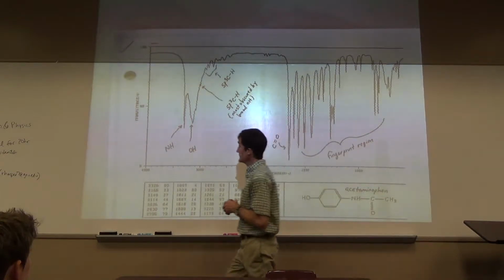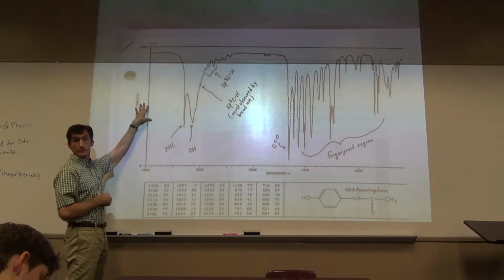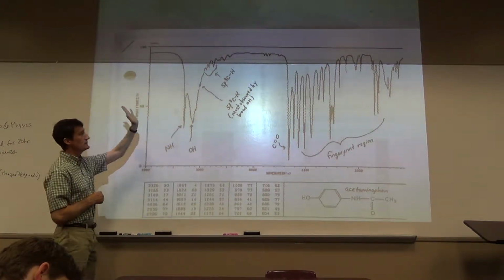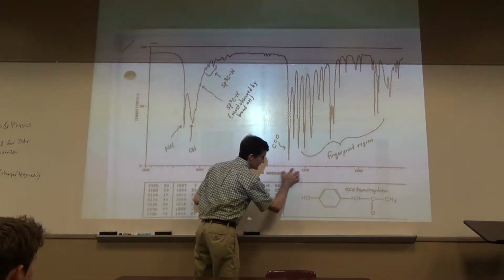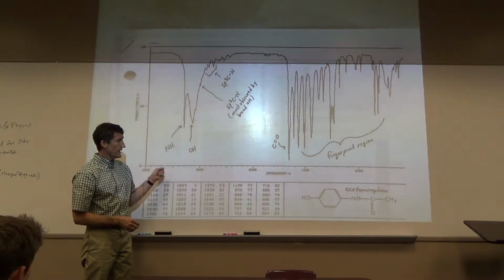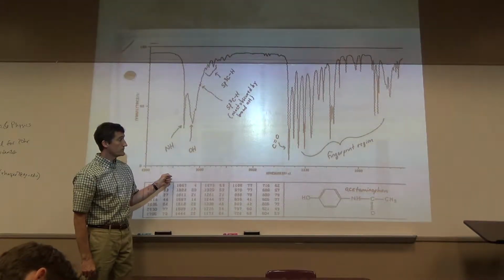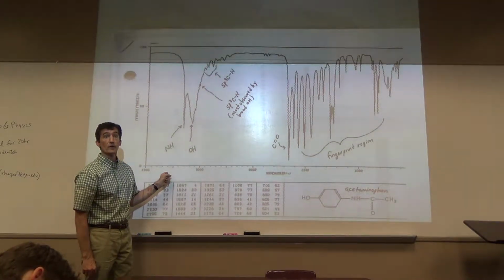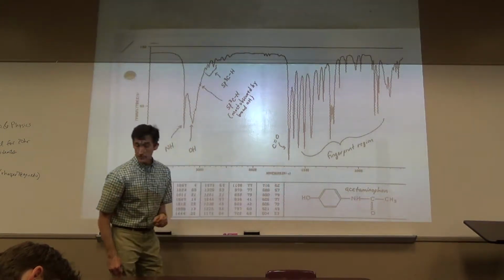Okay. Have spectrum. Basically all these peaks are absorbances. We have axes: this is transmittance, or basically absorbance. The more transmission you have, the less absorbance you have, but it's basically the same thing. Down here on this axis, it can be of anything you want, but it's the light. It can be frequency, it can be wavelength. You can turn it into any of those, essentially energy. We have equations for all that. This is wave number, if you can see that on your paper.